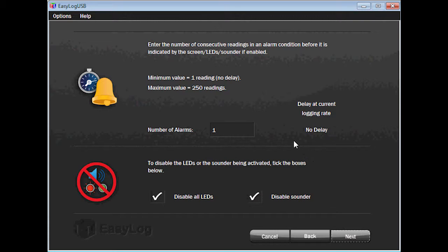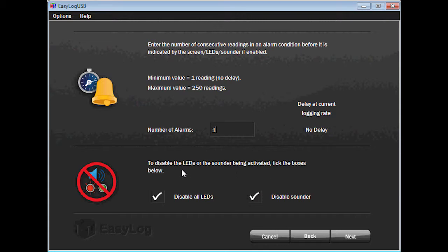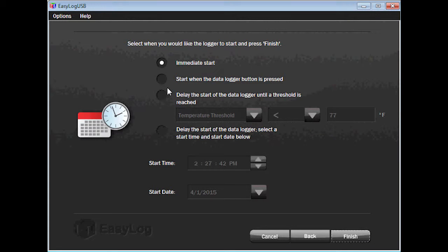On the next screen, enter a value for the number of consecutive readings in an alarm condition the logger must register before it is indicated by the screen, LED, or sounder if enabled. If you increase the value, there will be a delay before the logger triggers an alarm. For example, if I configure the logger to perform a reading every 2 minutes and increase the value to 3, the logger will not indicate an alarm if the alarm condition is 6 minutes or less. I will leave the value at the default setting of 1. You now have the option to disable the LEDs or sounder from being activated in the event of an alarm — simply uncheck the boxes. You can now choose to have the USB data logger start recording right away or set a desired date, time, or threshold.